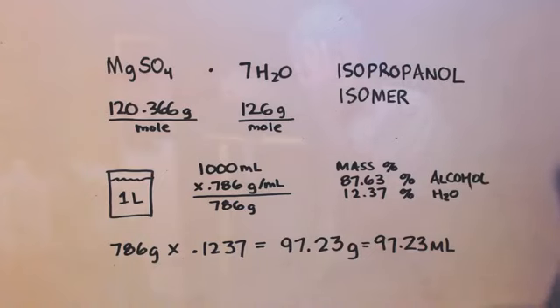There's a little bit at the bottom, so you know that it's saturated. Then it will form 2 layers. Separate your layers in a sep funnel, and what you have left is pretty much pure ethanol, or not ethanol, isopropanol. And then you just add a little bit of magnesium sulfate in to get that trace amount out, then distill it. You'd have some super pure 2-propanol.